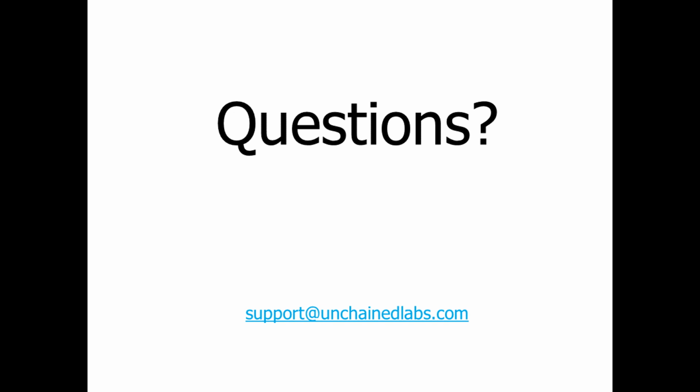Thank you. And circling back, and this might be a bit of a duplicate here, but if you have any additional comments to expand, we're upgrading our CM3 software to LEA 9, but we'll be going to benchtop standalone mode. Will Design Creator still work? Yes, it does. And I see another question here about compatibility with LEA 8.3. I believe that's a reference to LEA Benchtop as well. So yes, it is compatible with that. The versioning number on Benchtop is a little bit different, but it does work with Benchtop 8.3.